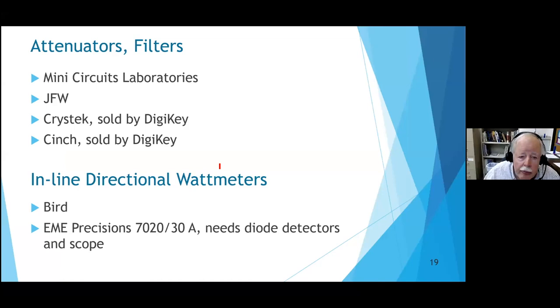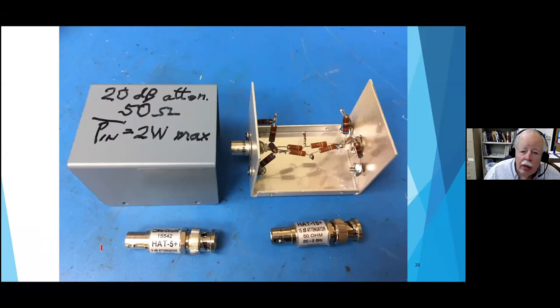To buy attenuators and filters, go to Mini Circuits Labs, JFW, or DigiKey - very convenient. For an inline directional watt meter, Bird is the oldest name in the field and they're great. A German colleague uses an EME Precision model, but you need diode detectors and an oscilloscope to read it. Here's a homemade 20 dB attenuator in an aluminum box with carbon composition resistors, alongside some commercial 5 and 15 dB attenuators.